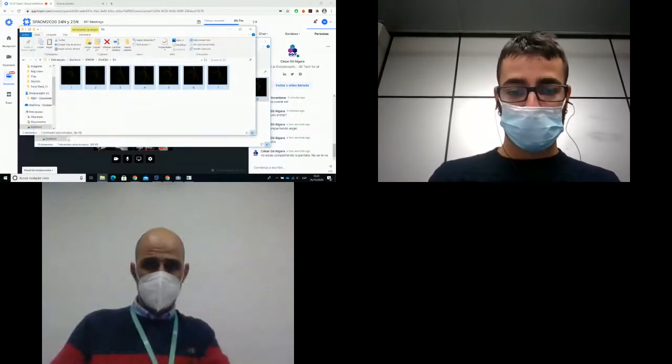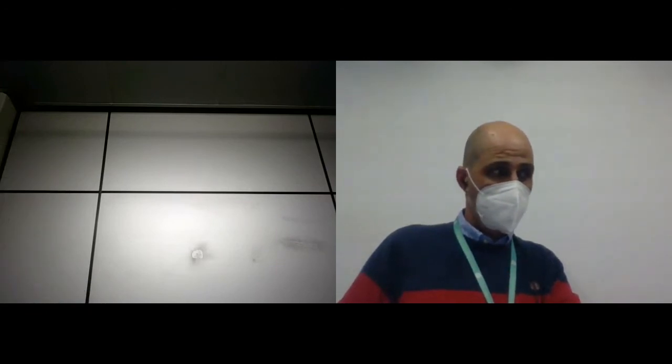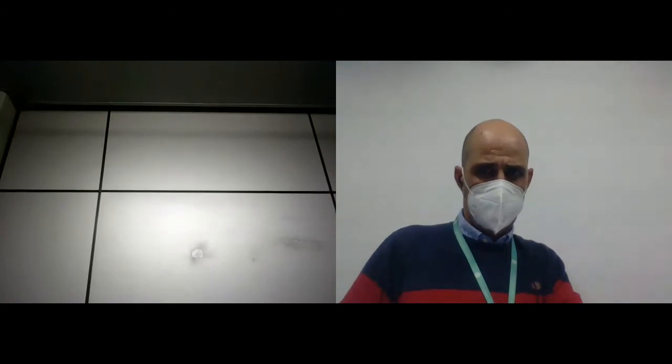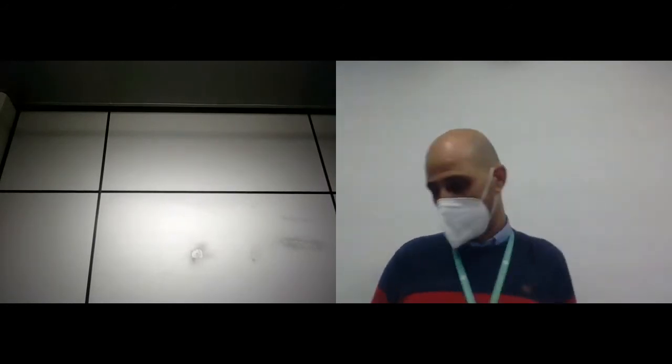Okay, let's switch to the other sample. You can, let's say, focus as you would with your microscope in the classical way.